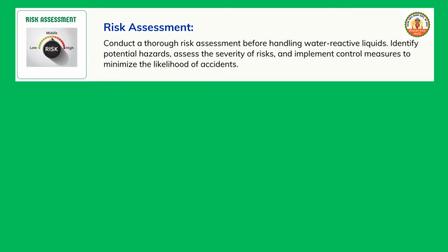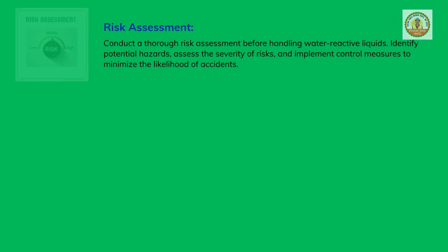Risk assessment. Conduct a thorough risk assessment before handling water-reactive liquids. Identify potential hazards, assess the severity of risks, and implement control measures to minimize the likelihood of accidents.